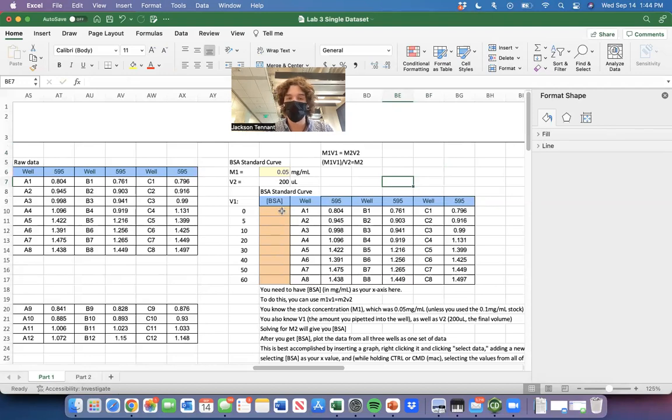Now, all I have to do is just select the right values and go for it. So first of all, something that's really cool with Excel is you can type in an equation and reference some cells, and then you can pull that equation down, and it'll do the same equation as far as you go down. The thing is, unless you tell Excel to, all of the cells you reference, it'll move them down at the same time. So you need to tell Excel to hold certain cells, like these values here.